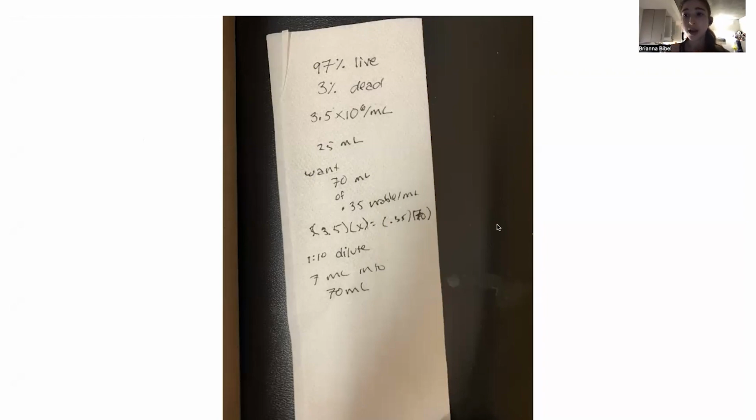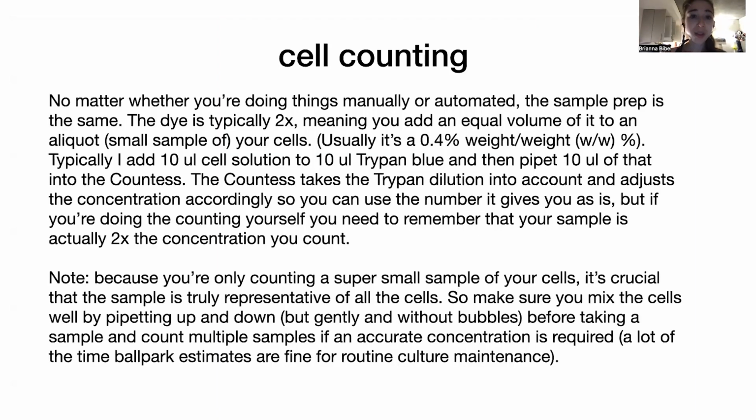And I'll post a link to a useful numbers for cell culture guide for determining how much to seed various plates. It also depends on when you want to next split them, or harvest them, or whatever you want to do next with them. The lower you seed it, the longer you get to wait before you use them, or the longer you have to wait before you use them, depending on your point of view.